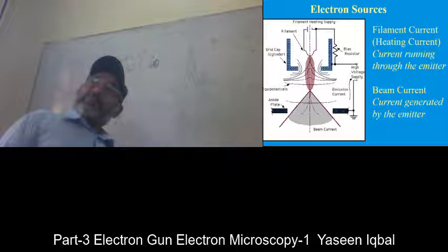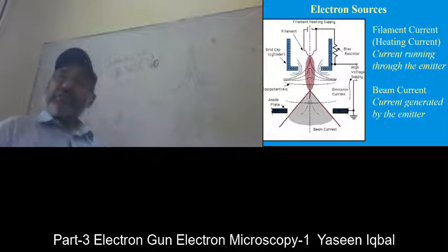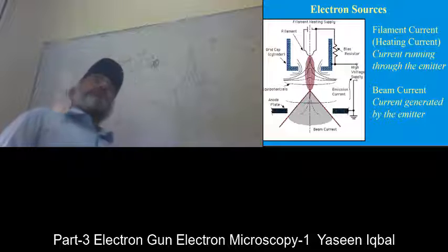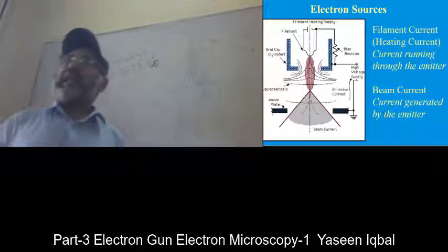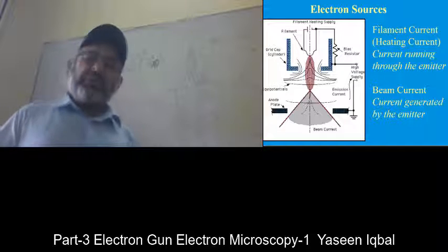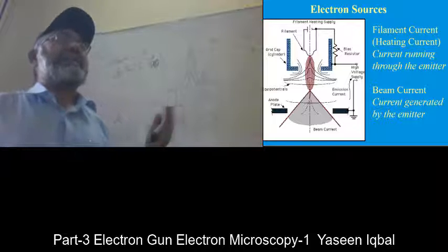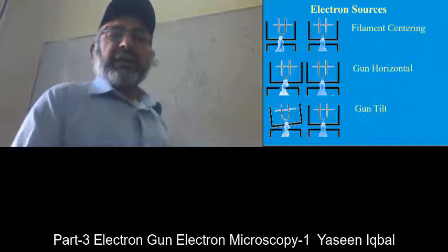The brightness of them falls upon that area because there is no transmission there. With the help of the bright region, you see the darker region. And it gives you a controlled level of illumination to see the features invisible or inaccessible during bright field electron imaging.